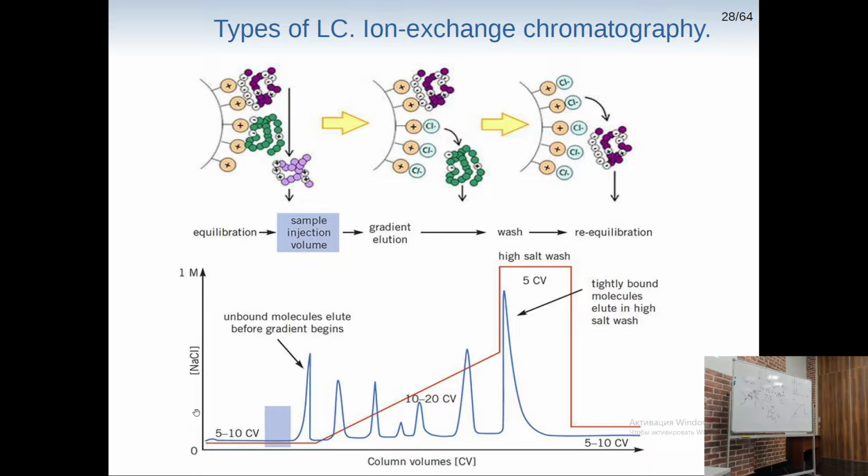Just an interesting idea here is that we have two orthogonally different ways of separation: hydrophobicity, hydrophilicity, and charge. And we can actually do tandem chromatography to have even better separation, right? We can fractionate by ion exchange chromatography and have here a lot of salt. Then we can go to reverse phase chromatography, get rid of salt, and also separate by hydrophobicity and simplify our mixture. Even if you have just 10 different fractions, it's already easier to work with such fractions.